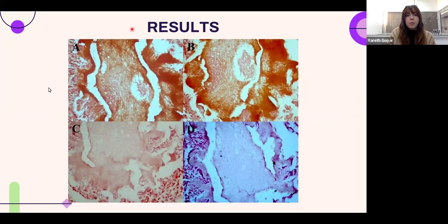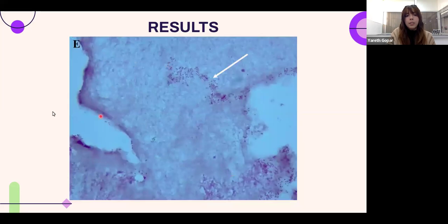Here are the results. These mycetoma sections were stained using our optimized technique. And as you can see, the tissue releases the excess dye as time progresses, with A being the shortest time, followed by B, C, and D. As time passes, the contrast improves and allows to differentiate the bacteria while at the same time conserving the tissue morphology. This is the previous D slide at higher magnification, and highlighted by the arrow are gram-positive cocci, while the tissue simultaneously can be appreciated by its morphology.